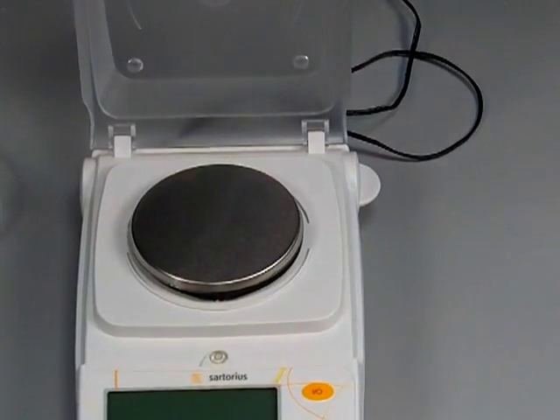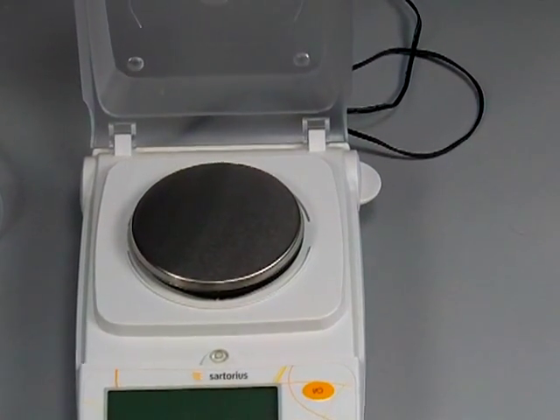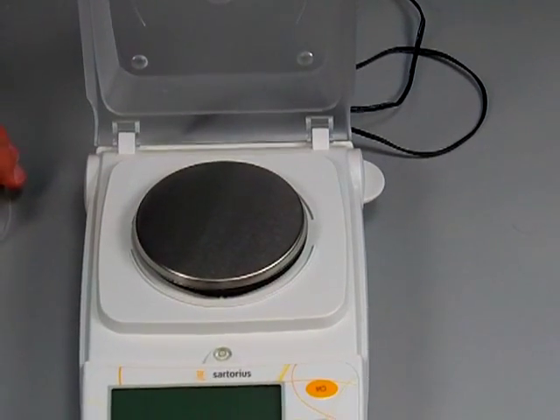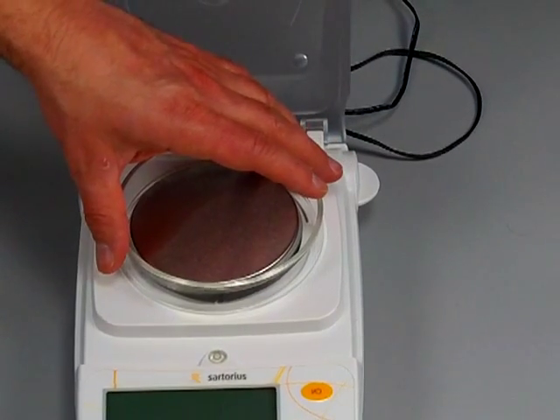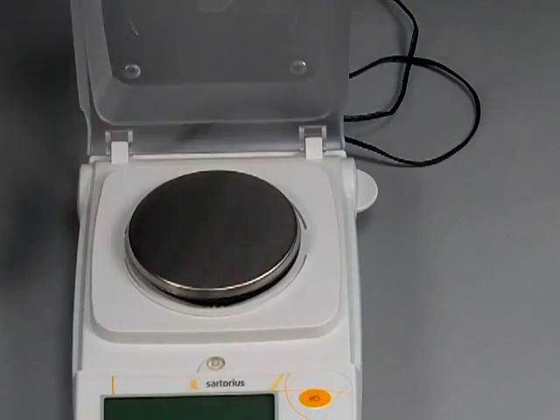On the milligram balances, they're all the smaller platform, and the spill ring only comes with the AY 303 and the AY 123.